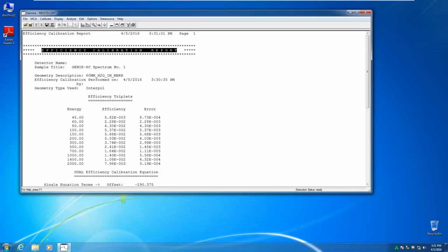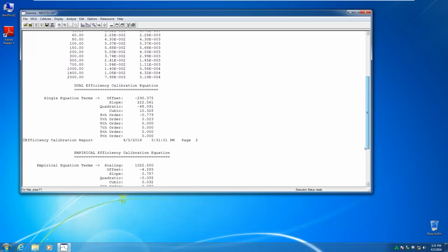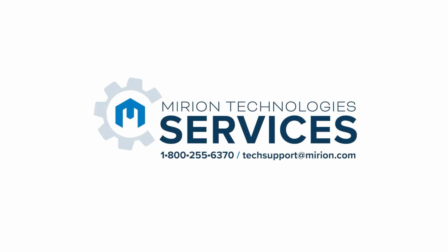This concludes our do-it-yourself video on how to perform a Labsocs efficiency calibration. For further assistance, please call 1-800-255-6370.